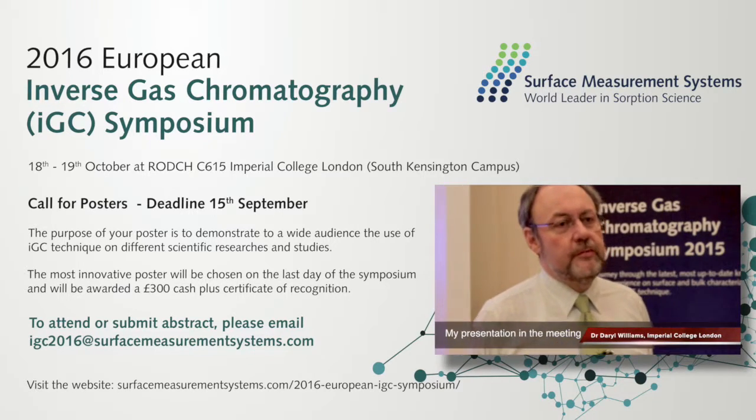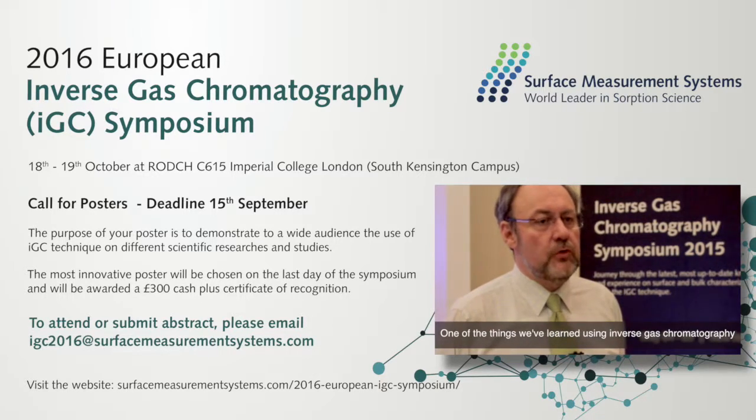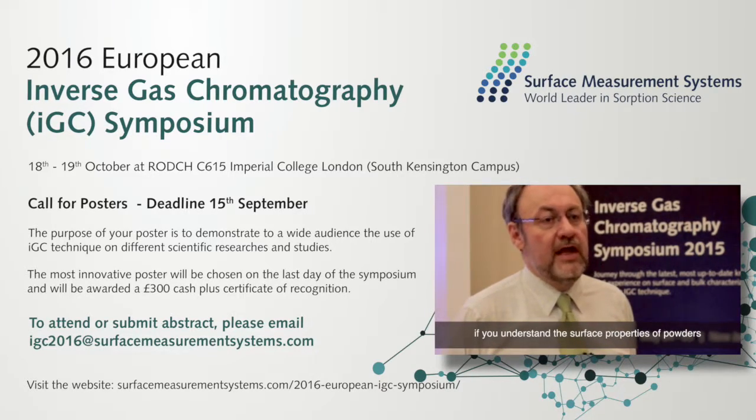Well, my presentation at the meeting really focused on understanding how surface properties are important for pharmaceutical materials, particularly the surface energy of pharmaceutical materials. One of the things we've learnt using inverse gas chromatography over the last 10 years is that surface properties of pharmaceuticals is a really important area, and we've discovered that things such as powder flow, powder milling and powder cohesion can all be studied if you understand the surface properties of the powders, and specifically if you know about the surface energy of the powders.